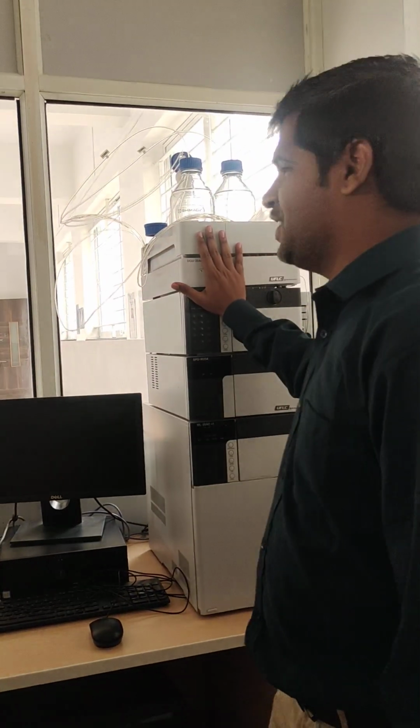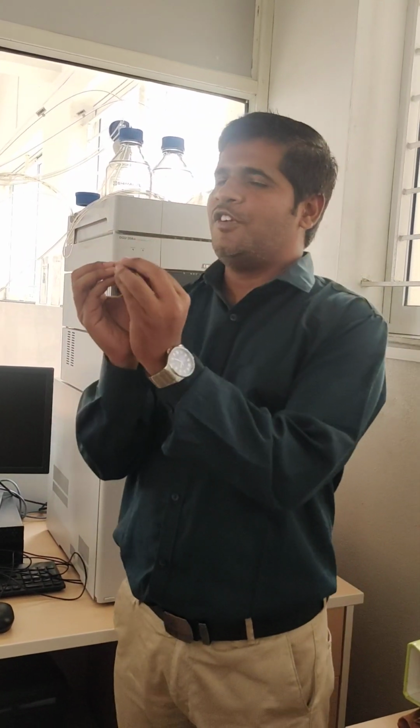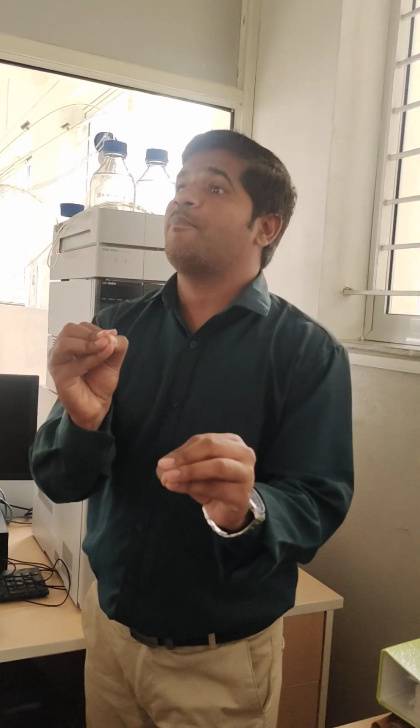The principle of HPLC is related with the partition coefficient. What is that? Partition coefficient means the distribution of a solute or drug between the liquid stationary phase and the liquid mobile phase. If the solute has the highest affinity towards the liquid stationary phase, that compound has more retention time.